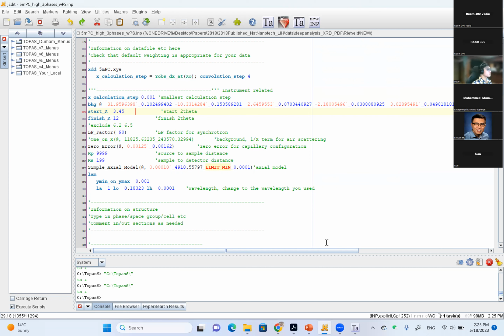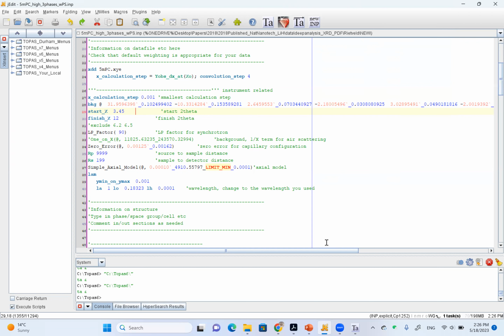How do we deal with the background? Do you remember how we deal with the background? Yes, polynomials. Right? So basically, background is a polynomial. So that's very easy, right? Anybody who went to college, you're familiar with the Taylor series. Taylor series is always a good approximation of any function. Taylor series in essence is just polynomials, right?